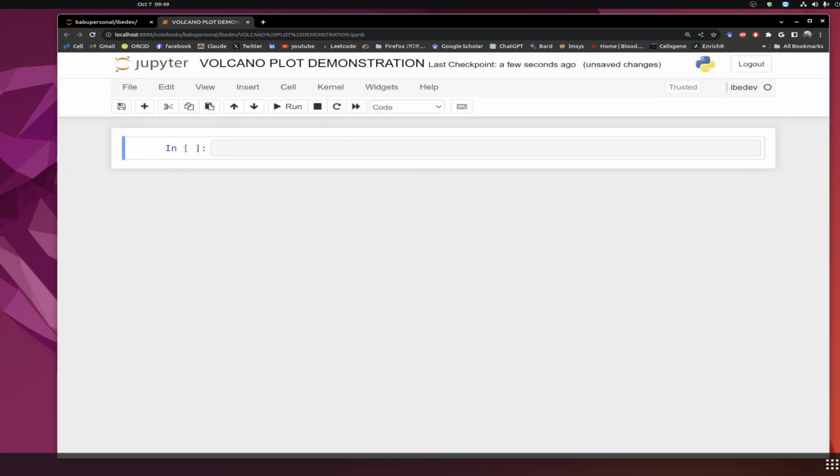To begin with this, we have to be very careful. Let's check the recording is okay. Okay, let's begin by importing the different libraries. One of the basic things is what are the common libraries that are used for data analysis and visualization in Python. I hope by this time you have already learned details about that. So let's start with importing the libraries.